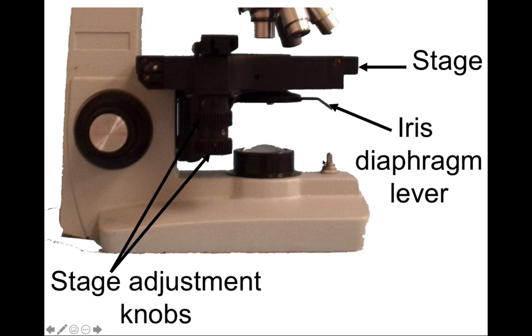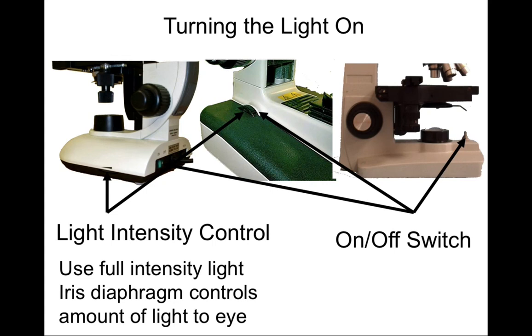We have our light source, and there's an on switch to turn the light on. However, the amount of light coming from the light source is very important for getting the best picture, and that is why we use the iris diaphragm lever. The iris diaphragm lever adjusts how much light is able to pass through the stage and through the microscope slide. You will find the iris diaphragm lever just below the stage. The second way to regulate the amount of light is with the intensity control — every microscope will have some way to control the amount of light emitted from the light source.